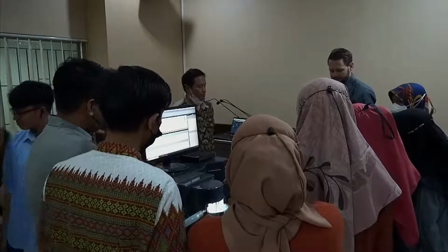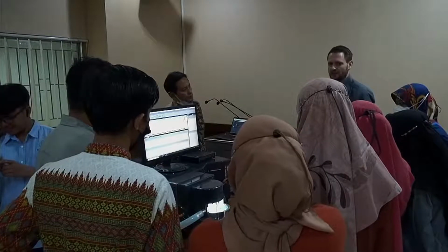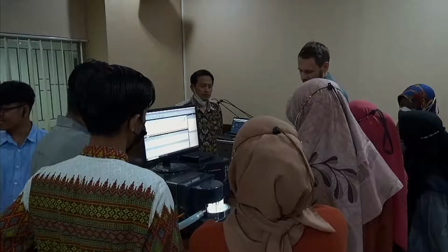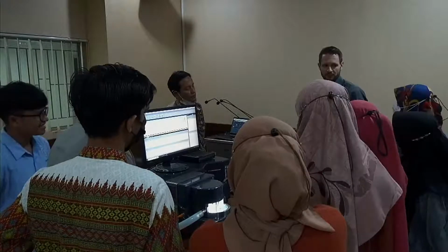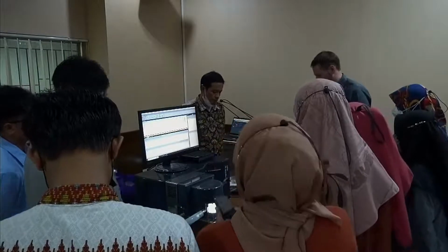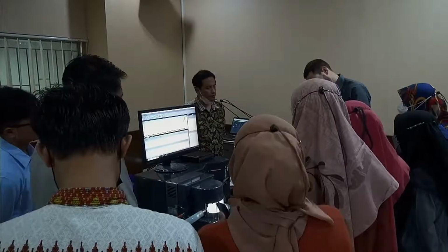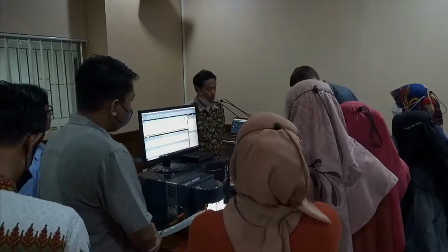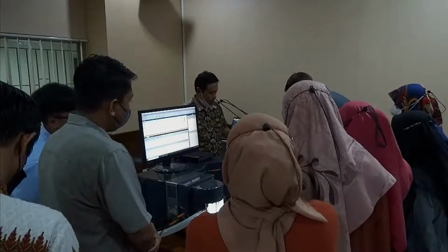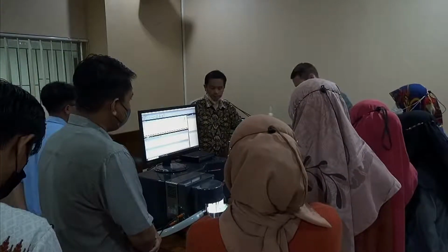The reason you usually do what I do now is when you have an unknown sample, a sample you've never measured. I don't recommend you to directly give it in there, because it might be a waste not only of material but also of time. So the standard process when encountering a completely new or unknown sample is always the same. Basically, you first take some water, which is the water? This one, okay. So you put water in a beaker.